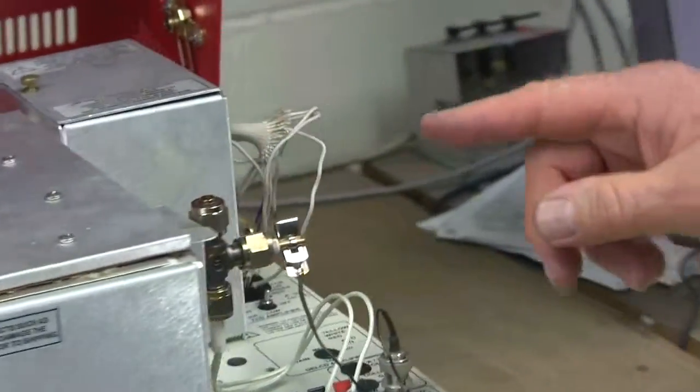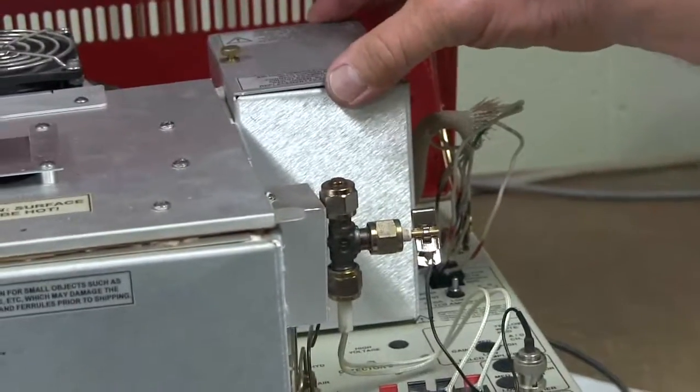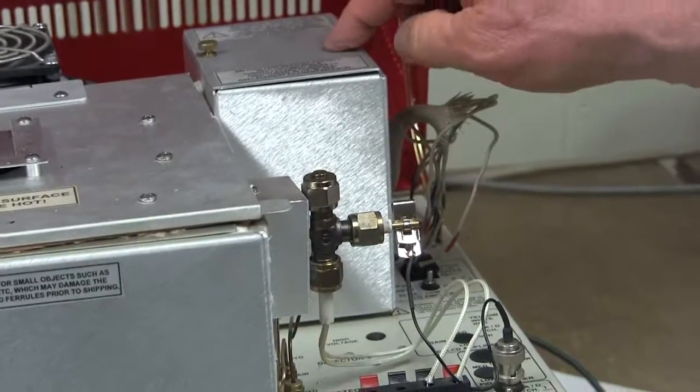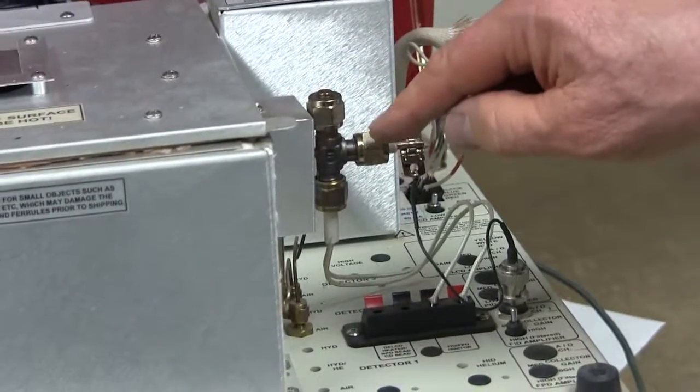This GC here has two detectors. It has a thermal conductivity detector, which is in this box, and a flame ionization detector.